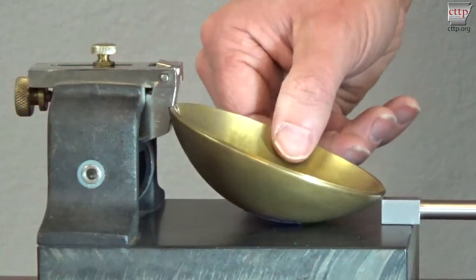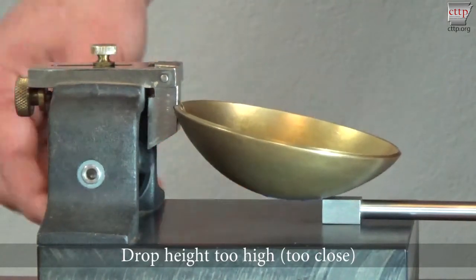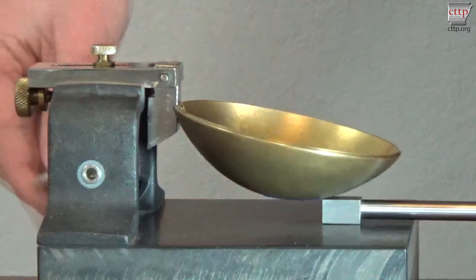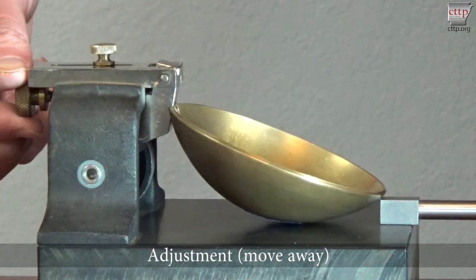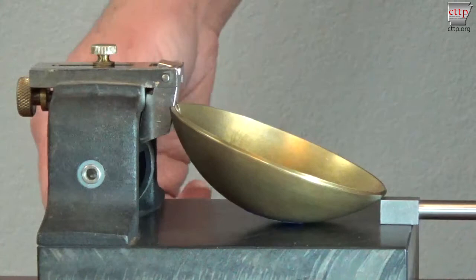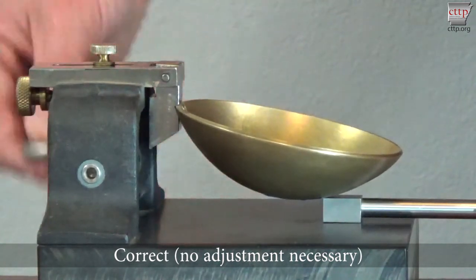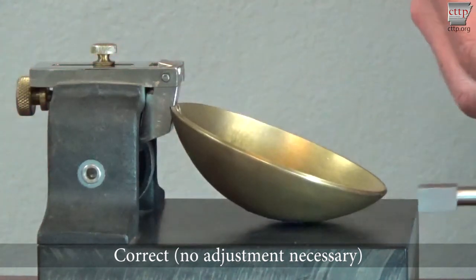Reposition the gauge block so that it is level with the base and in contact with the tape and turn the handle. If the cup rises and drops back down to the gauge block, the drop height is set too high and must be adjusted. To reduce the drop height, loosen the set screw and turn the adjustment screw on the rear of the machine to move the cup away from the cam. Tighten the set screw and reposition the gauge block. Turn the handle and watch the cup. The cup drop height is set correctly when contact is being made between the hanger arm and cam and the cup does not rise off the gauge block.